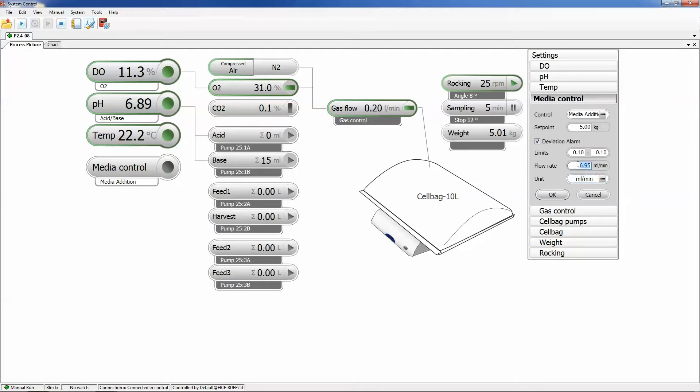For example, for accurate acid or base pH adjustments, addition of feed supplements, or for perfusion culturing.